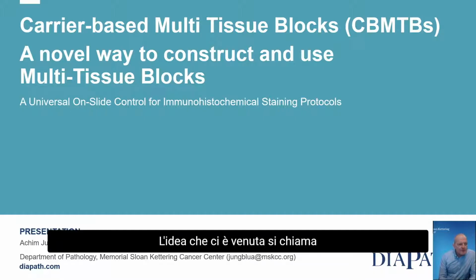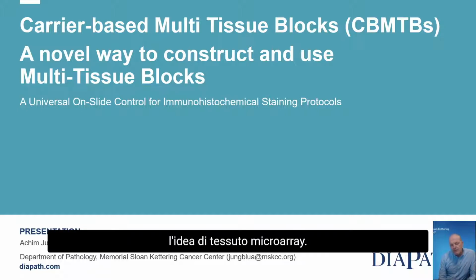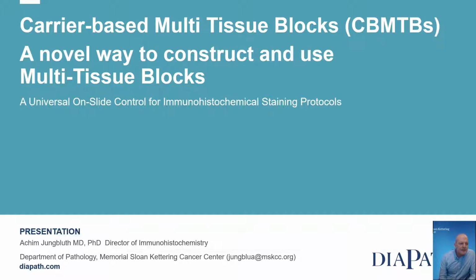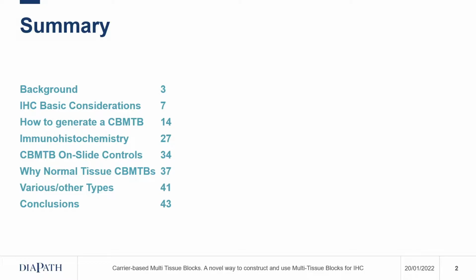The idea that we came up with is called carrier-based multi-tissue blocks. We call them CB-MTBs. Most likely the term tissue microarray crosses your mind, but this is a different concept really, and it's not micro, as you will see. And yes, it's a novel way how to construct multi-tissue blocks.